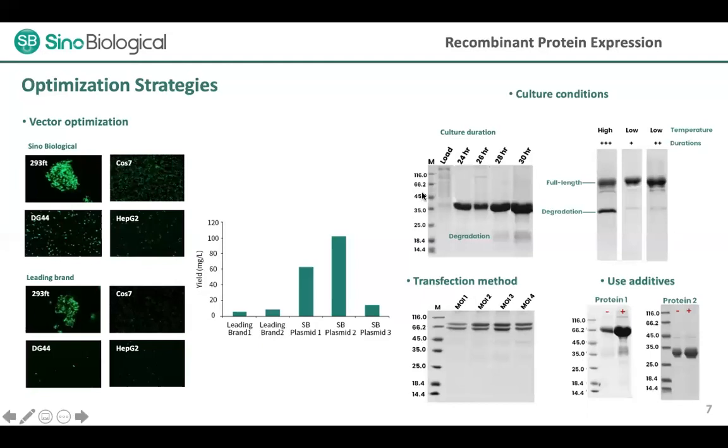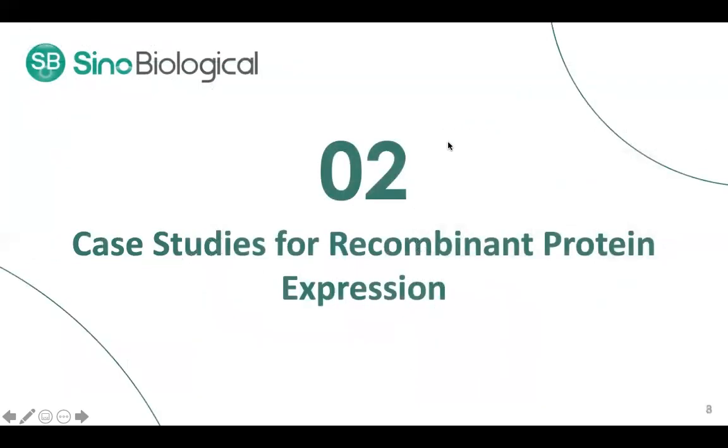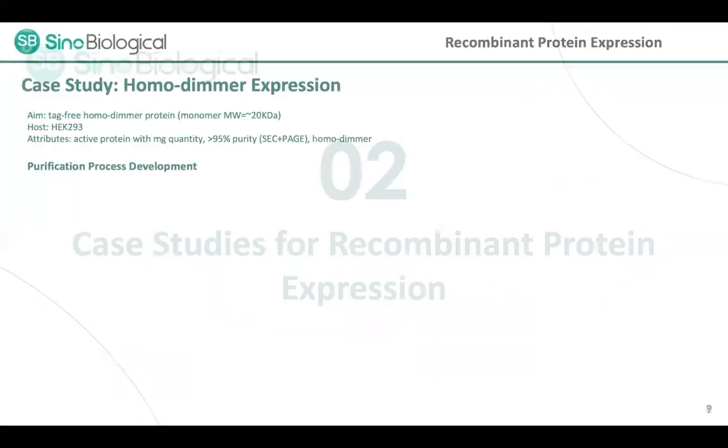So these are, of course, very broad descriptions of how we optimize protein expression. Now I would like to show you a few case studies to demonstrate how this work is done here at Sino, and what types of strategies we use for protein expression optimization.